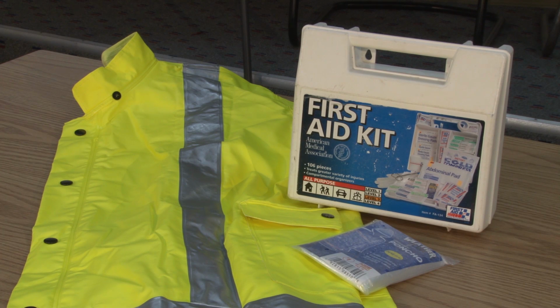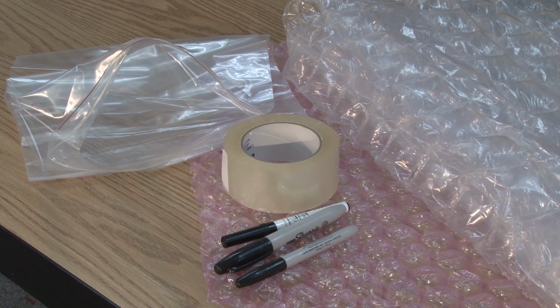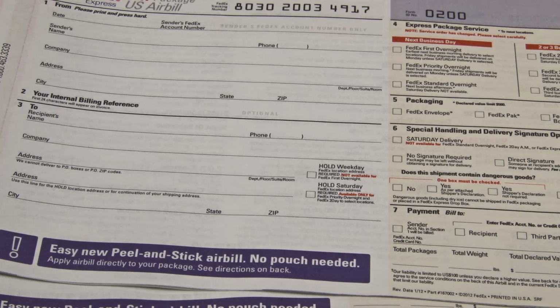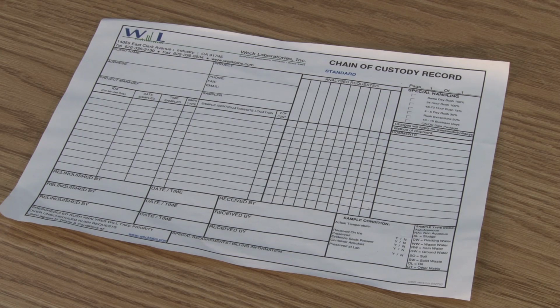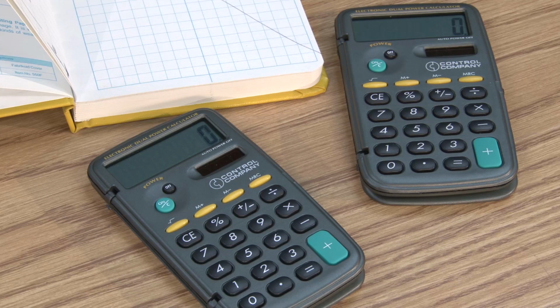Miscellaneous equipment includes supplies necessary to perform sample collection. These include a measuring device such as a tape measure or yardstick, clear wide tape, indelible ink markers, clear plastic resealable bags and packing materials such as bubble wrap, extra sample container labels, shipping instructions and labels, the sampling analysis plan, or SAP, the chain of custody form. In addition, you will need a weatherproof logbook and calculator.